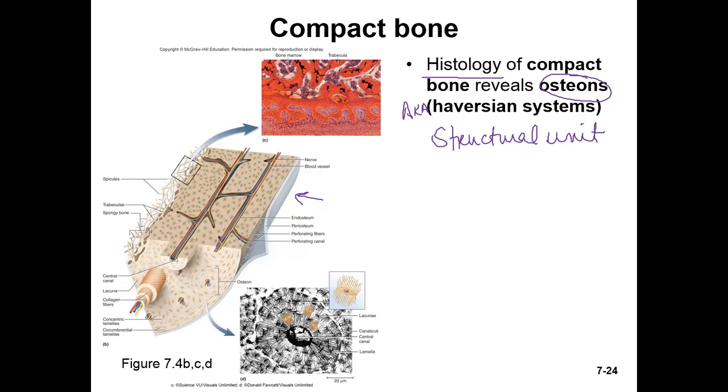So this is going to be the periosteum around the outside, which you know has two layers. It has the fibrogenic layer and it has the osteogenic layer. And the periosteum is dense, irregular connective tissue proper that's wrapping around the outside of our bone tissue. And then this part is actually bone, being compact bone. And we would go through compact bone before we would get into the spongy bone if we were down at the proximal end. Or this could simply be the medullary cavity if we were right in the middle of the diaphysis of the long bone.